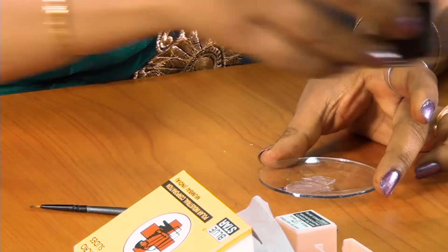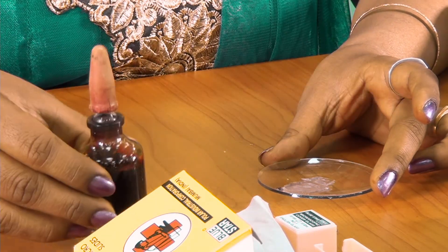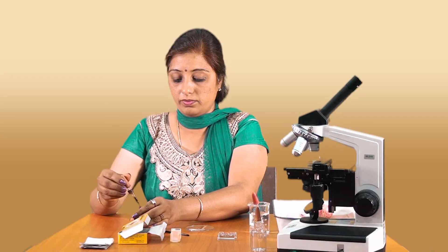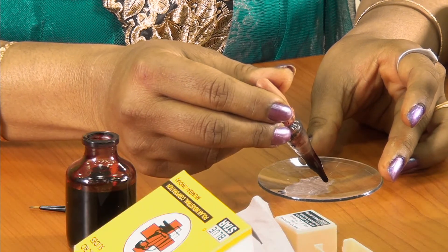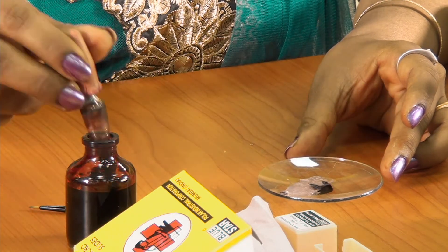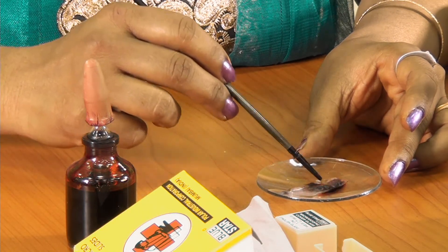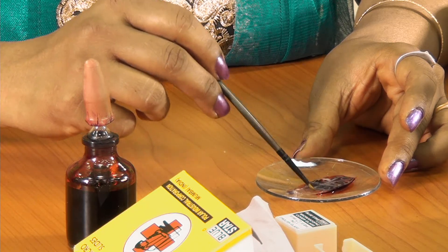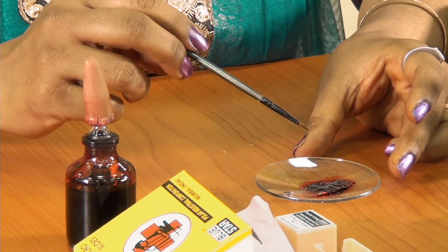To this peel, use the saffronin stain in order to colour it. Two to three drops of saffronin would be sufficient for this. I am going to wait for about thirty seconds.